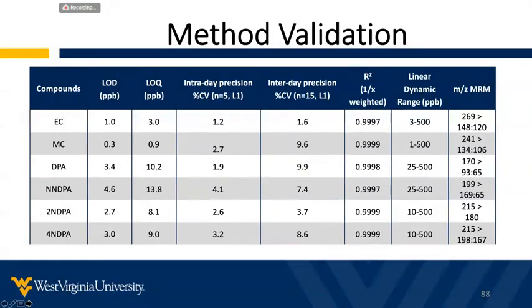For organic gunshot residue, we have focused on the top 6 major markers that have been consistently reported in the literature: ethyl centralite, methyl centralite, DPA, and the NDPA family. Since our last publication, we did some additional optimization and improved detection limits. We spent a lot of time working on identification criteria, making sure we have good confirmation by retention time, ion ratios falling within the validation range, good linearity, and good reproducibility over time.